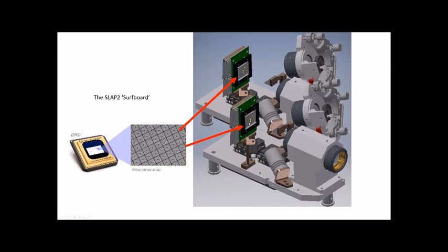So the center of a mirror in the bottom section gets perfectly imaged onto the center of a mirror in the upper section, and it exactly cancels out the diffraction effects that are created. You basically trace the lines through the ray diagram back out, and everything comes out like it was coming in, essentially.